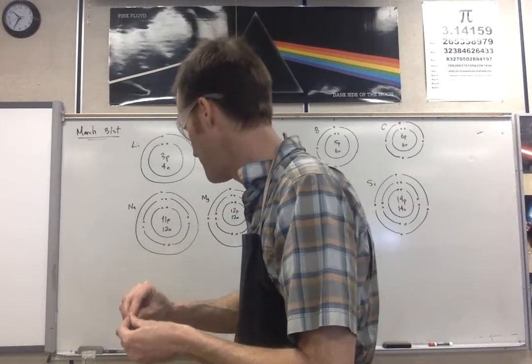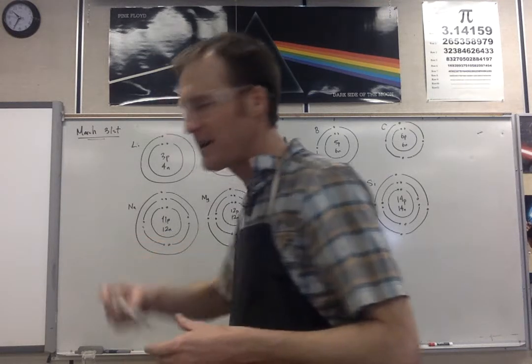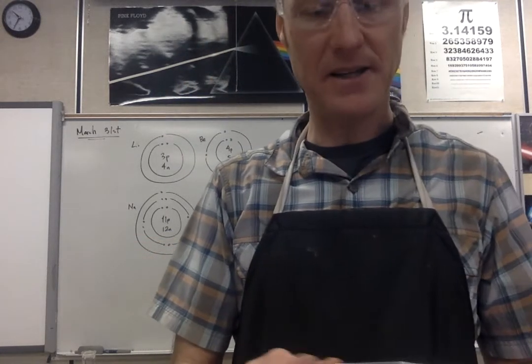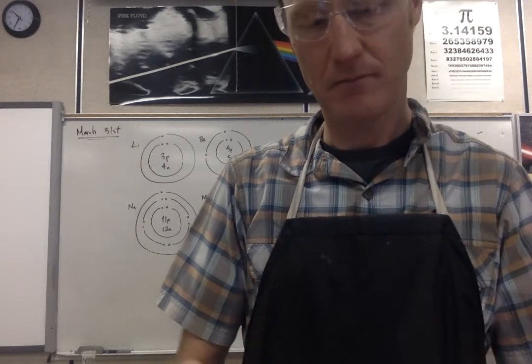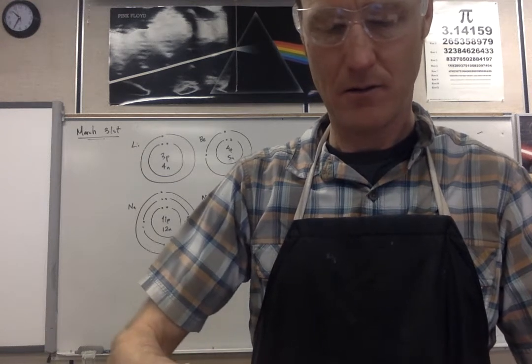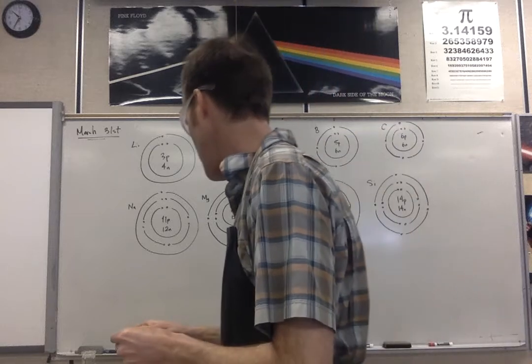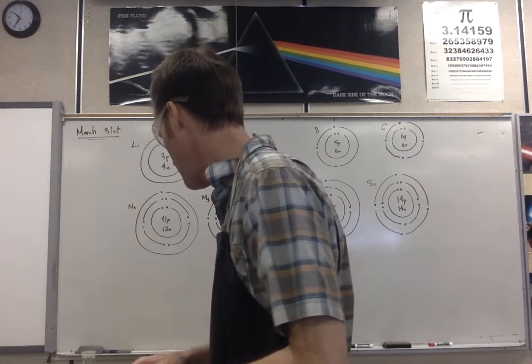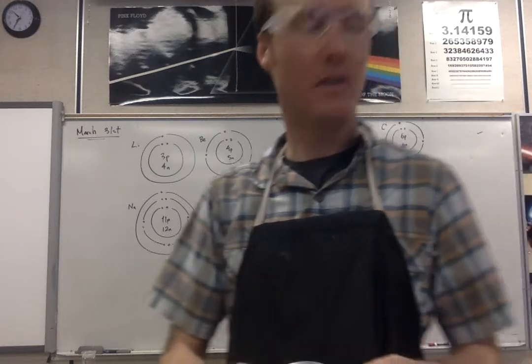We're going to add that to the water. And then I'm going to get out a sample of magnesium metal strip. So I've just added that to the water, and we'll come back to all of those.